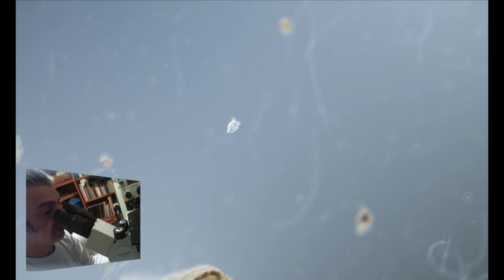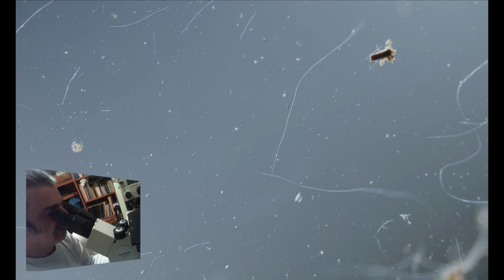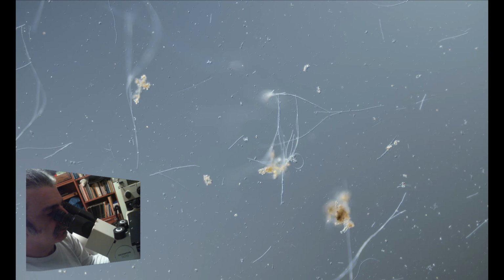Oh, here is a nice ciliate, Mesodinium or Strombidium. I can't remember the difference, sorry. One of them, oh, it jumped. Yeah, those are very fast. Like a strawberry. Yeah, no chance of finding it now.